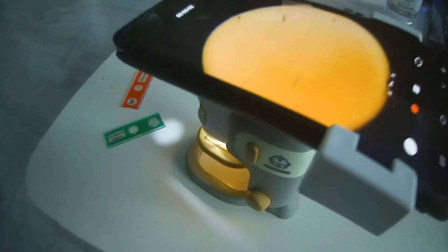So now you've got a nice workable microscope. Oh, wow. This actually works. So you are definitely going to need to focus in order to see because it does zoom in quite a lot. So the bottom one, this is your coarse focus, and then this is your main focus, this little plasticky screw here.